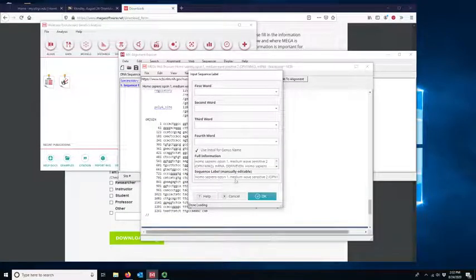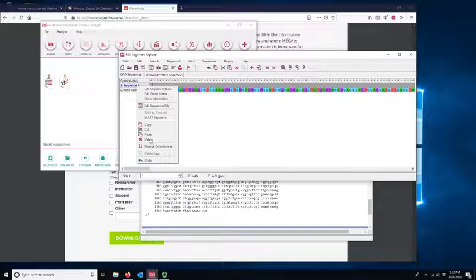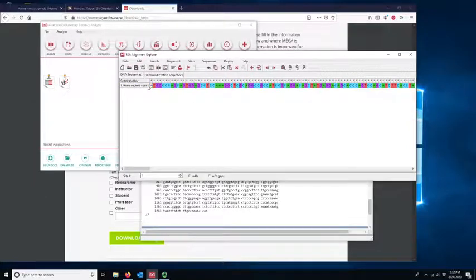So I'm going to open this up. It will automatically give it the name. You can change it if you want, or you can leave it the same. So I'll just maybe shorten this for simplicity's sake and leave it as, that's the full information. Let's change the name here: Homo sapiens, opsin 1. Okay. When I do that, it's going to automatically load it into my alignment. My placeholder one's still there, so I can get rid of that one now if I want to. I'll just delete that. And here we have start codon all the way through.